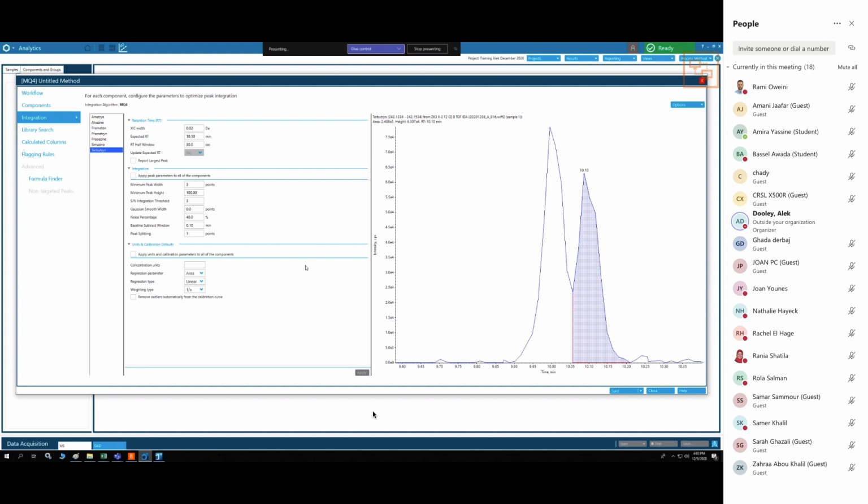Okay, so that's done with the integration. Any questions on that? Everybody understand what we did? Yes, clear.